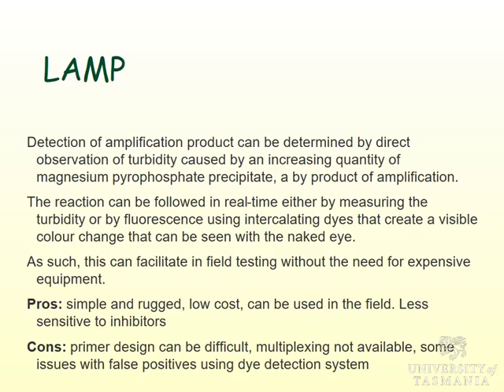So you've got tomato spotted wilt primers, and we've got our cucumber mosaic virus primers, and we've got our turnip yellow virus primers. We add them in the one tube. This one's going to make a product that's going to be 300 base pairs. This one's going to be 500. This one's going to be 1,000. We run the assay. They're binding on all specific sites.